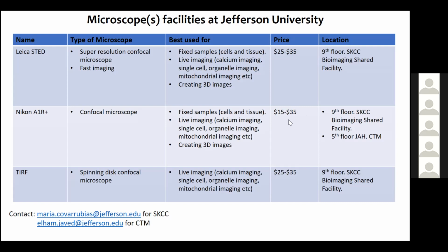And then for the Nikon A1R, I've put the range as 15 to 35 because 15 is what we offer at CTM. And again, if you're trained by Maria at KCC, it becomes 25. And then if you're using her help to image, it becomes 35.